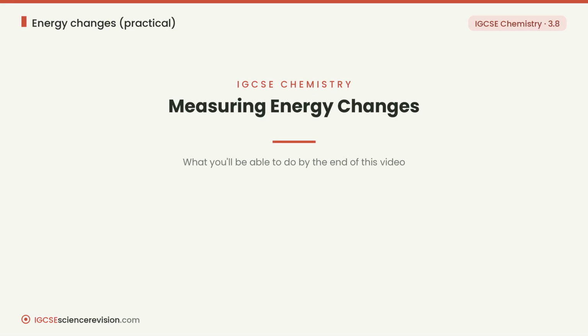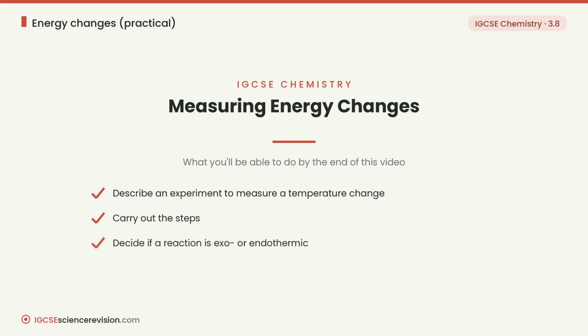In this video, we'll measure the energy change of a reaction by experiment, part of your IGCSE Chemistry course. By the end, you'll be able to do three things. First, describe an experiment to measure a temperature change. Second, carry out the steps. And third, decide whether a reaction is exothermic or endothermic.